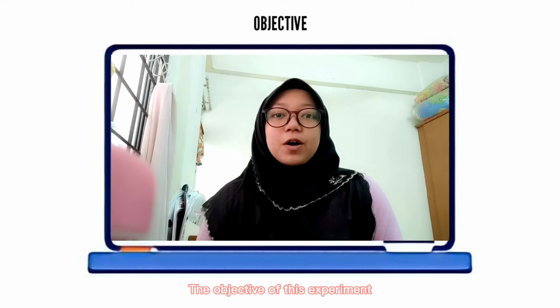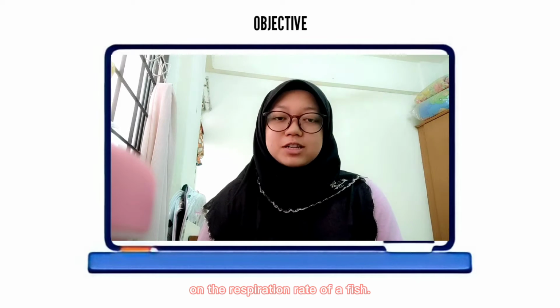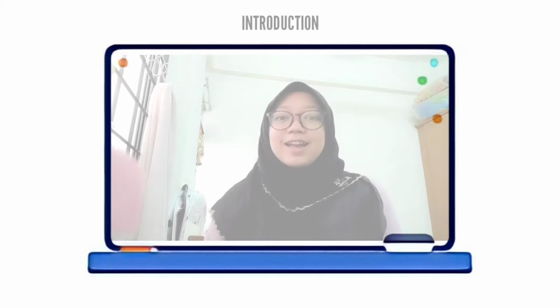Today I will do experiment 1, rate of respiration. The objective of this experiment is to identify the effect of water temperature on the respiration rate of a fish.